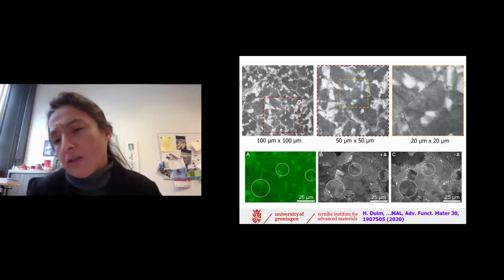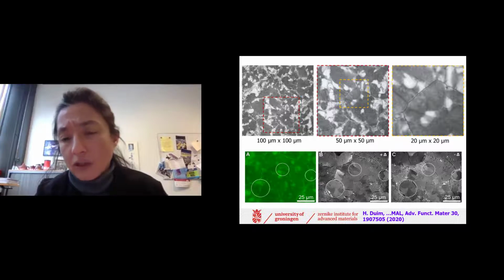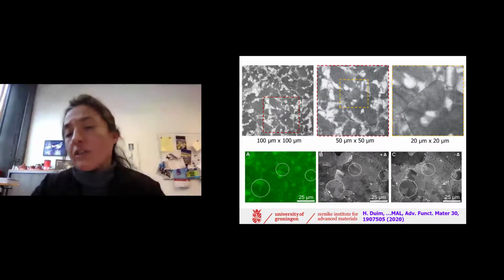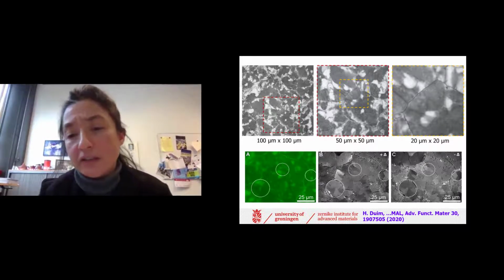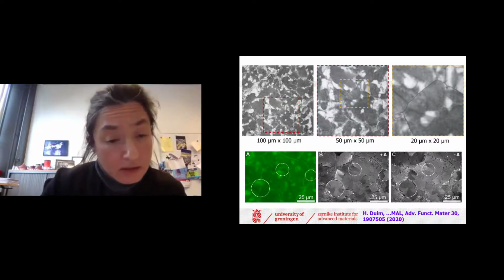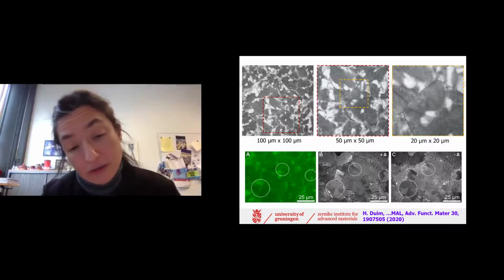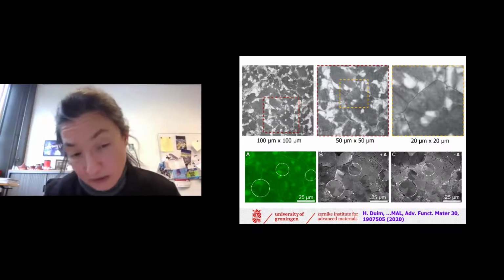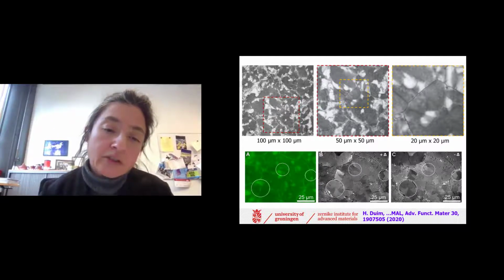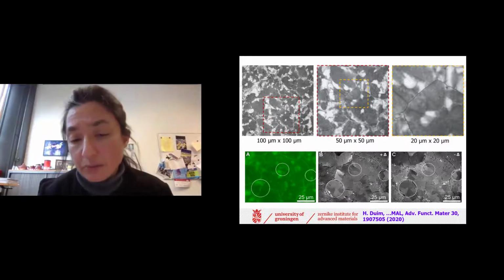You can clearly see that we can recognize the crystalline grains in the photoluminescence microscopy, but still inside the grains there are these inhomogeneities, very bright patches of photoluminescence and a bit more dark surrounding. Now, in the row below, the green image is a wide-field photoluminescence image, just exciting the sample with an ultraviolet lamp. And again, also in this image, you can notice that the photoluminescence has some inhomogeneities, bright patches.